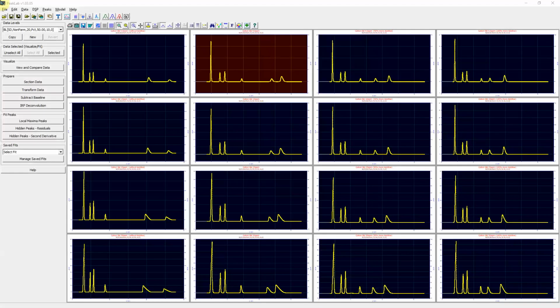In this video, we will demonstrate a peak modeling experiment with two independent variables. This is an IC ion chromatography study with 6 cations. There are 16 chromatograms in a 4x4 matrix where the concentration and the additive PDCA were varied.